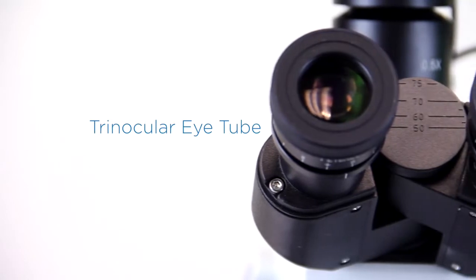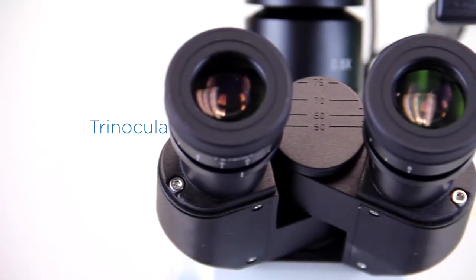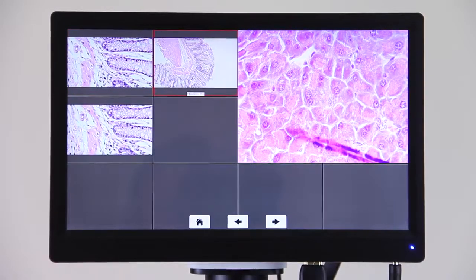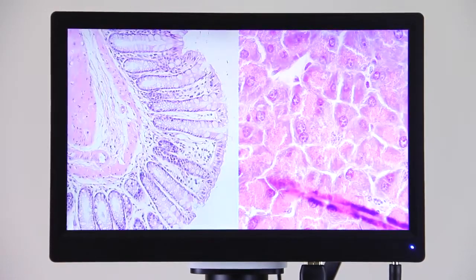The HD Microscope's trinocular eye tube accommodates the HD imaging system to create a complete full-screen or split-screen digital experience.